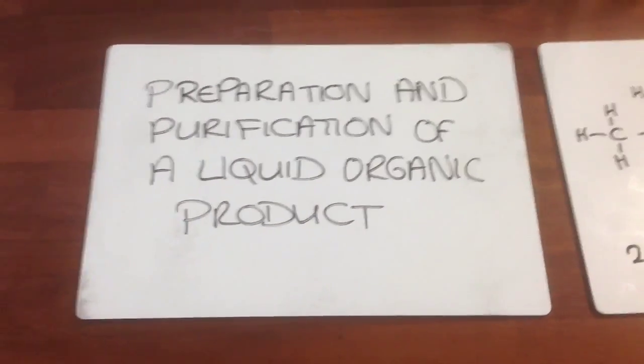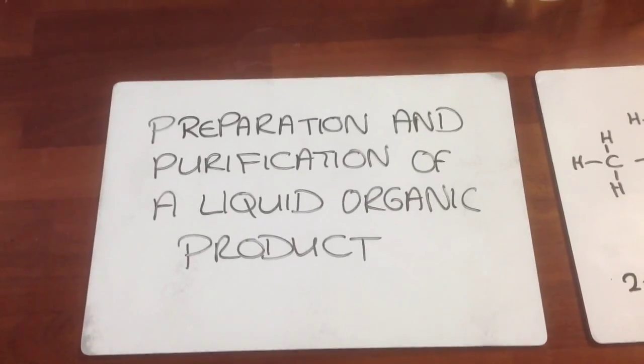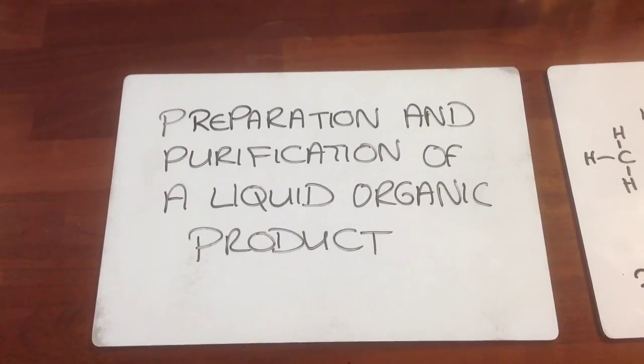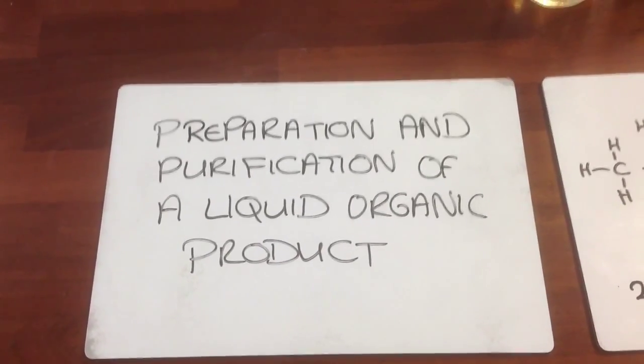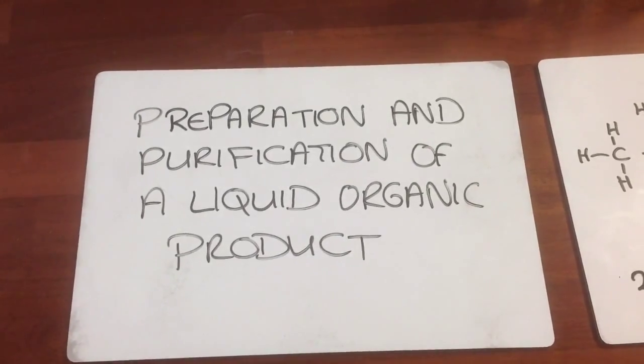This video looks at the practical steps involved in synthesizing an organic product that's liquid at room temperature. If it's solid at room temperature, then there's some different steps involved, and you'll look at those on another occasion.